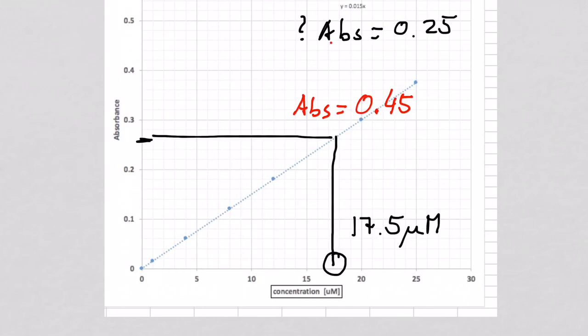You have to extrapolate the line. So this is what you're basically saying. Yeah? Extrapolate the line. Are you allowed to do that? No, why not? It might change up there. So it could be that it goes like that now.